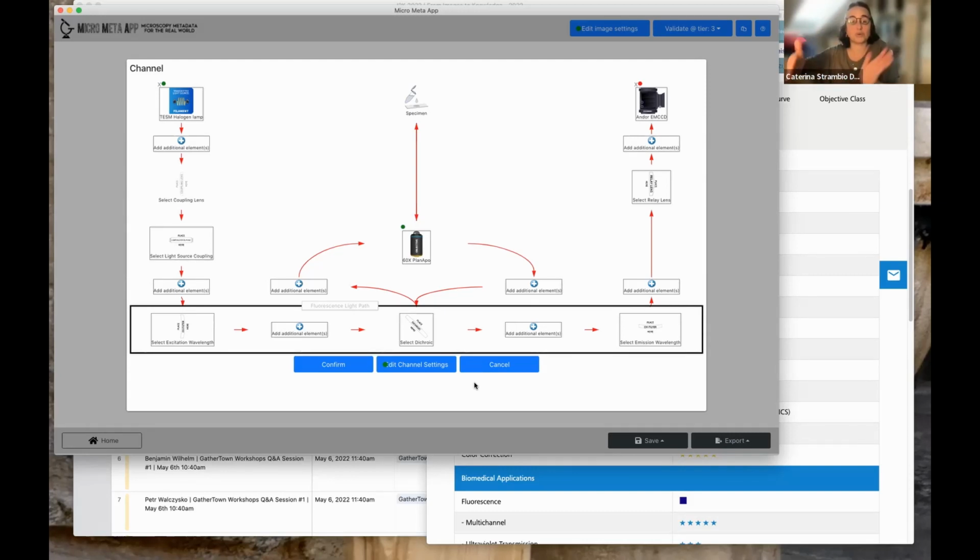But we have to go through these stages of generating the model and start providing tools to at least start collecting this information somehow, and then work with the manufacturer, work with the users to get to a point in which it's going to be much more streamlined.